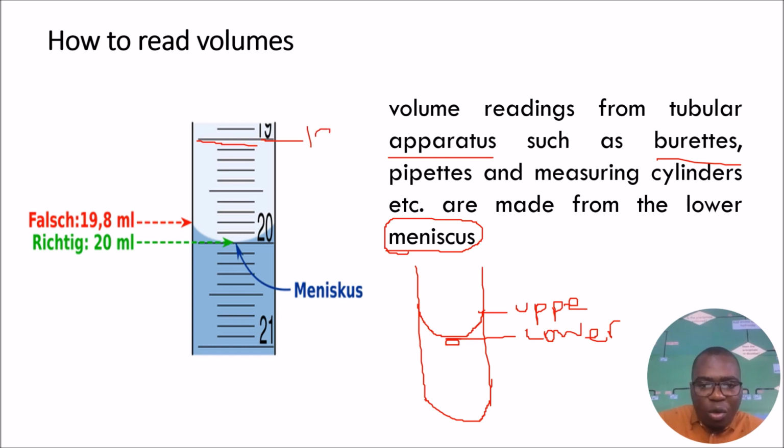Then this other long one here is 20. So how are these divisions being counted? Can I try one? If I say 19, 20, it's not going to make sense because the 20 is already here. So if one is not working, then I'm going to try 0.5. How about if I say this is 19.5, okay?